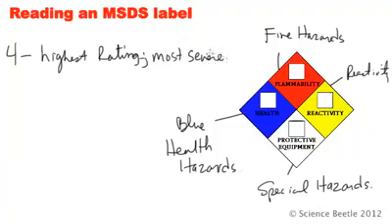When I say most severe, what I'm really talking about here is the most severe hazard for that particular color. So whether it deals with a health hazard, a flammable fire hazard, a reactivity hazard, or a special hazard, such as being a corrosive agent, an oxidizer, acid, alkali, something that you should not mix with water, or whether it's radioactive.